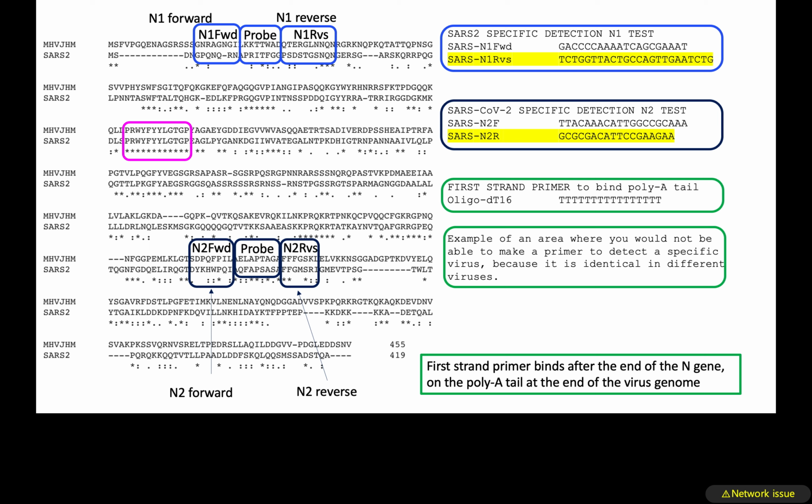That's the story of quantitative reverse transcriptase PCR, and we built it up from first talking about PCR, then talking about quantitative PCR, and then adding on the reverse transcriptase before we did our quantitative PCR to make quantitative reverse transcriptase PCR.